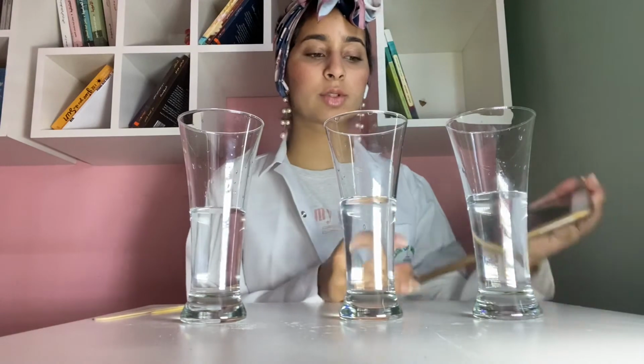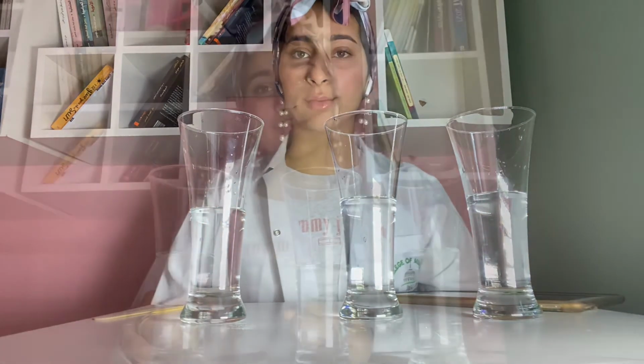Now, when we turn on the light, we will start our stopwatch to see how much time it takes for each container with a different concentration to have all of its discs floating again. After exposing the 3 containers at the same distance to the light source, photosynthesis took place in each container, but at different rates because they had different concentrations of carbon dioxide.